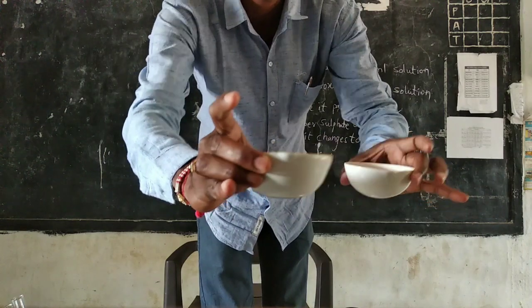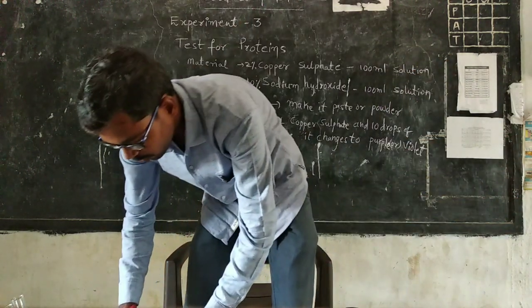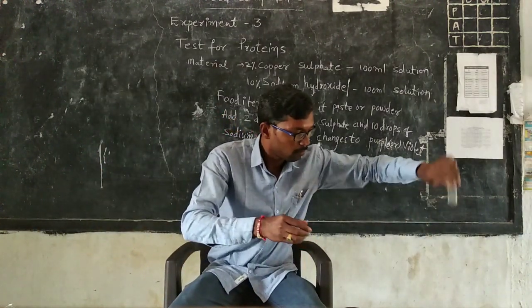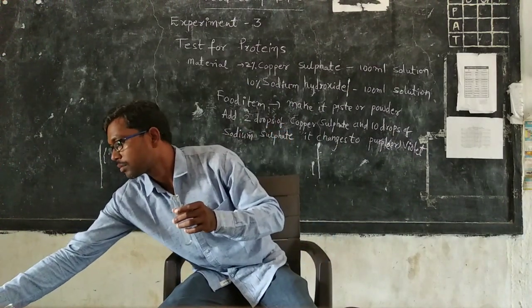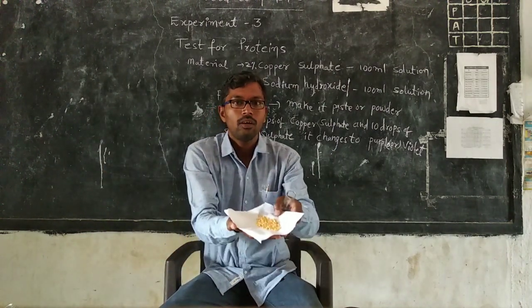This is the copper sulfate solution and this is the sodium hydroxide solution. Now we take a test tube. The food item we are using is dal.